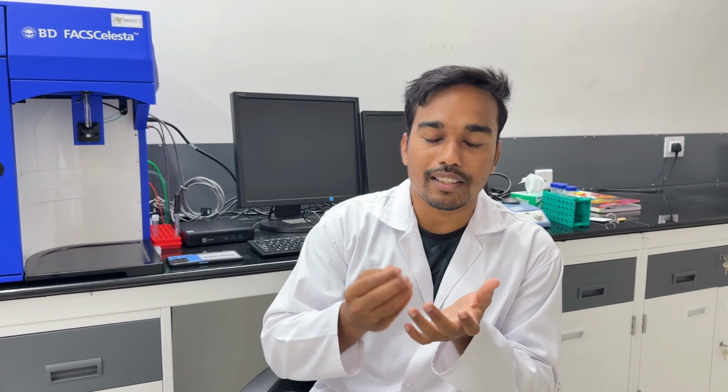So what we are trying to do as a lab here, we are trying to get some drugs which could be delivered directly to the colon region. And how we are doing it? We are encapsulating it in different polymers so that it could reach the colon region. But anything you eat gets digested in the stomach. So we are trying to protect this drug so that it doesn't degrade in the stomach and reaches the colon region. For that, we are using a strategy called polymeric coatings.